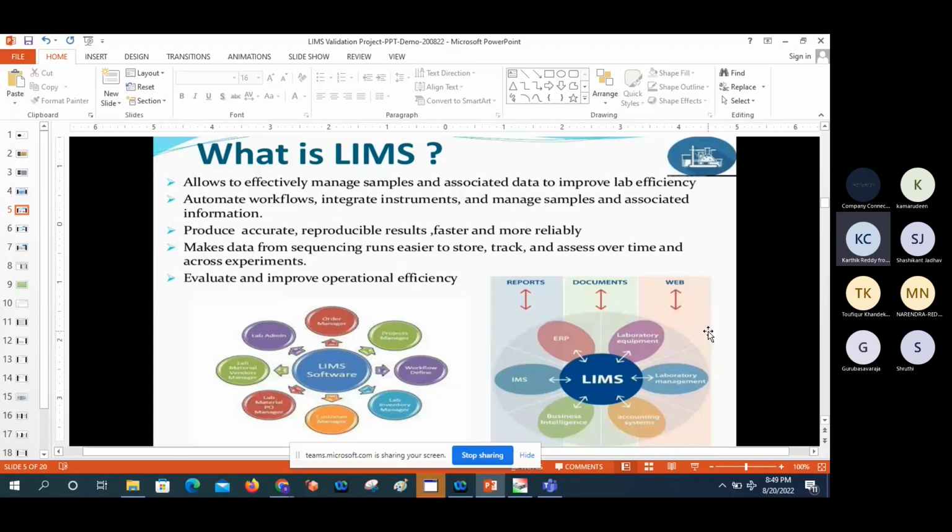The development environment is not an auditable environment. We can perform kinds of testing there, and we can also prepare the master data in it. Those data can be migrated to validation and then production. So a data migration procedure would be involved, as well as installation packages, whenever required, and we need to do this in the specific environments like quality and production.